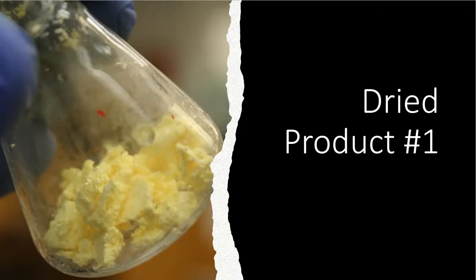All right, so I just let these hang out for over a day, and I go back into the lab on the very next day. The reason I did this is to let them dry, okay? I didn't want to do everything right now, so I left and went back the next day, on 10/17. So on 10/17, I take the dried product number 1.